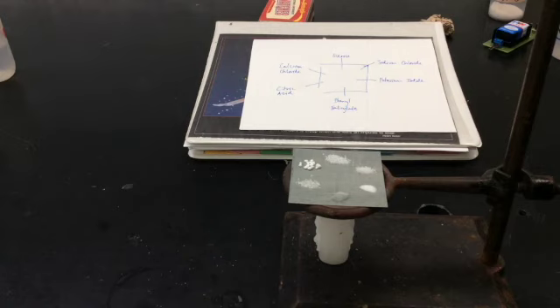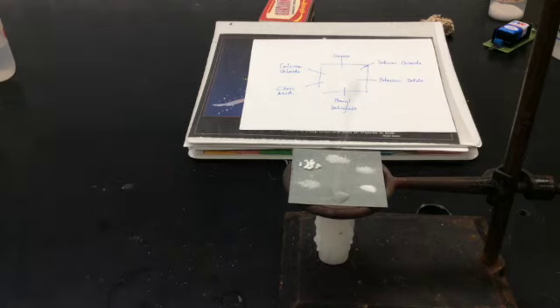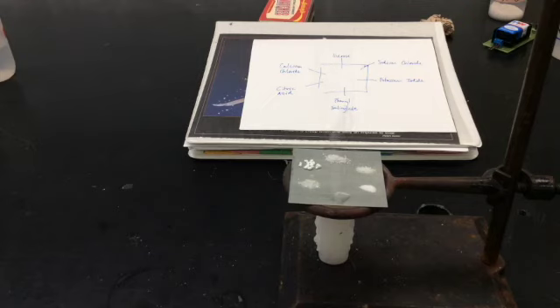The second compound to begin melting, you can see right here, is the citric acid. It's beginning to melt. And then you can see also the sucrose at the back has started to melt as well.